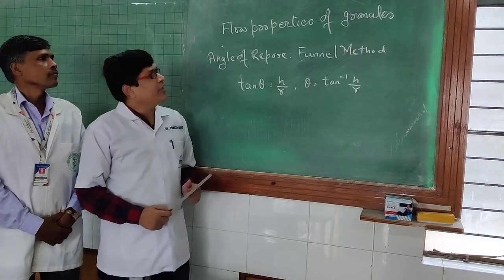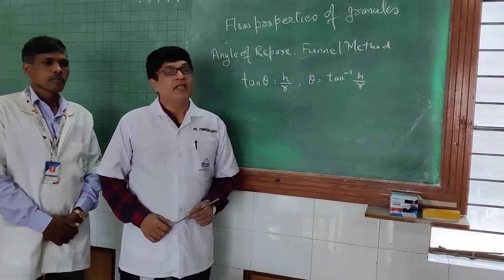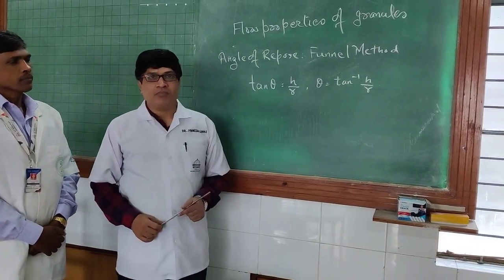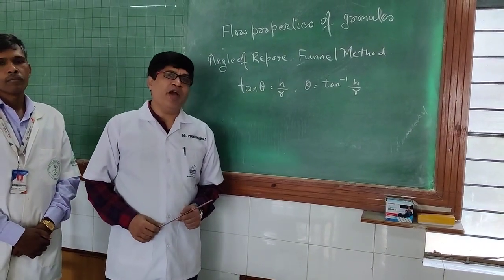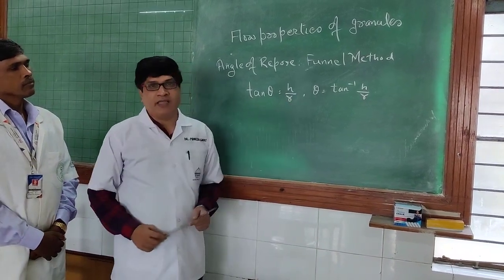So once again, good morning students. In order to find out the flow properties of granules, the method that we are going to use now is the angle of repose method. In the angle of repose method, we have different methods. The method that we are going to use is the funnel method.